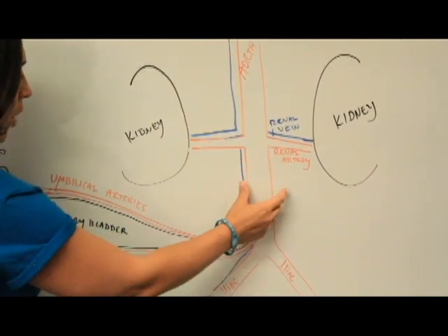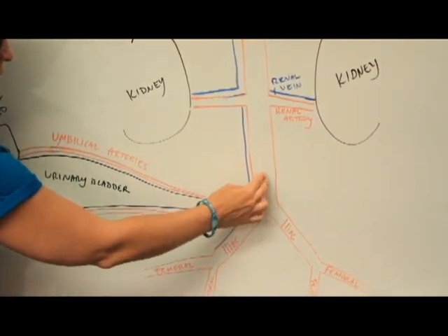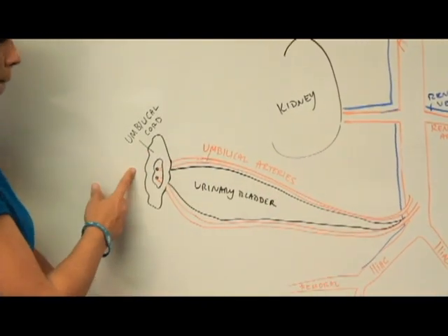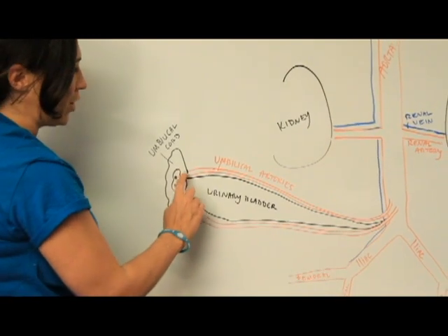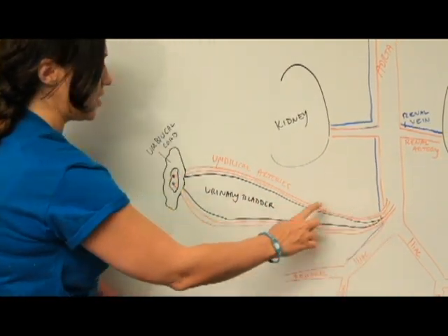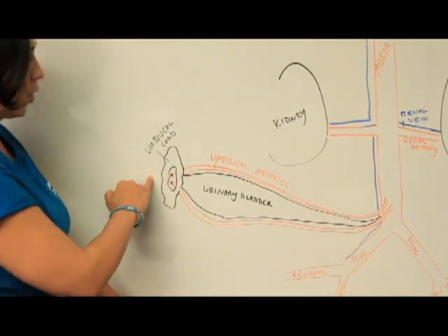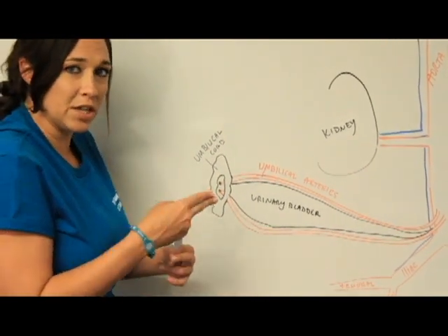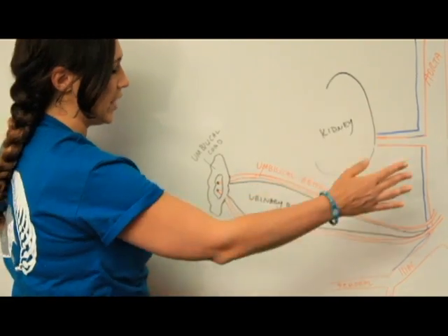Following this down, we basically have these two little arteries kind of offshoot, and this offshoot going up towards your umbilical cord. These are going to be your umbilical arteries, right? So they're going to follow all the way up to your umbilical cord. And we already cut the umbilical vein. Remember, that was attached to the liver. That's the first thing we had to cut to open up all of this intestine so we could see all this.